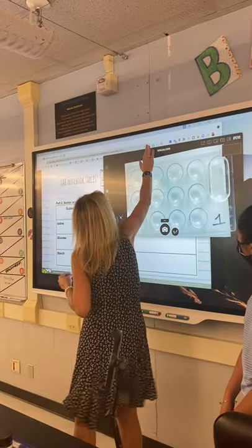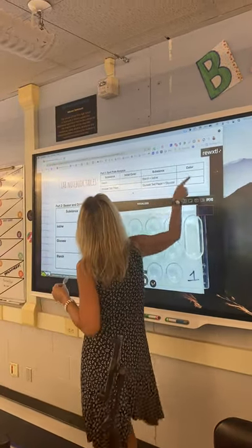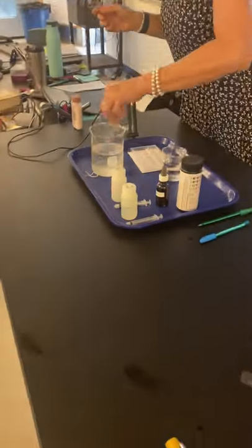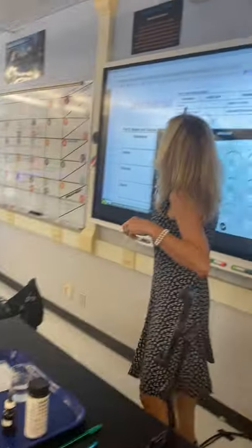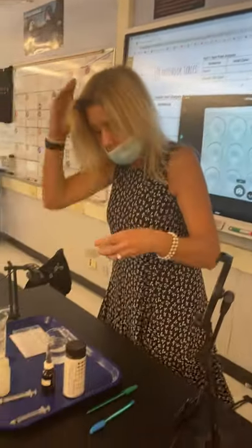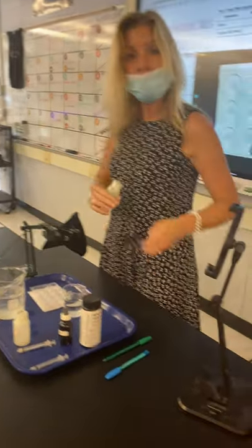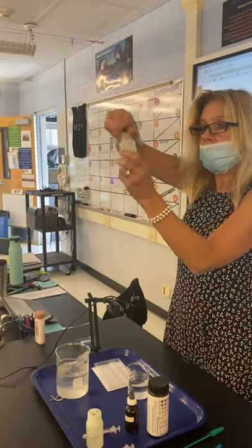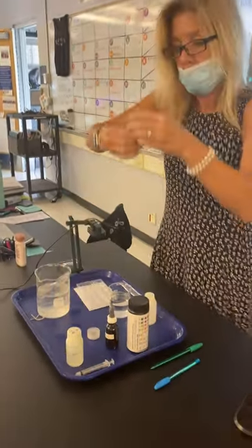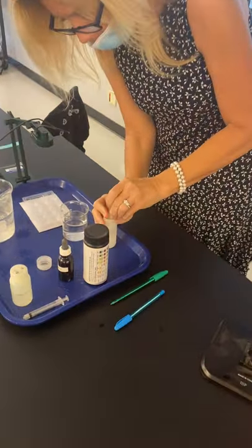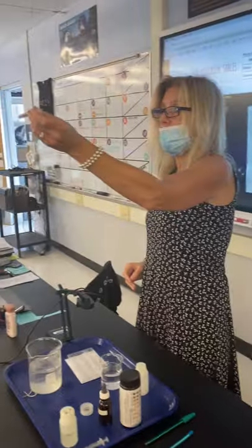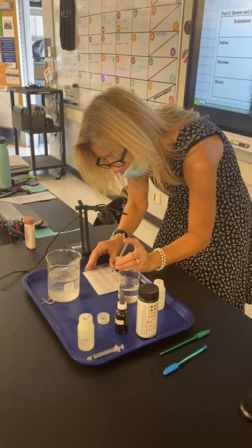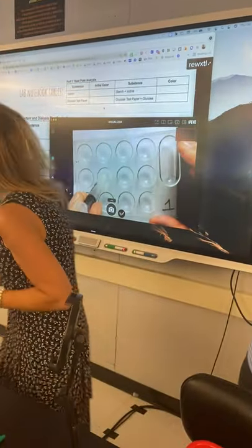So I'm talking about this part right here — this is what we're going to fill in and I'm going to show you here on the spot plate. The first one is starch and what is starch's initial color? So this is glucose and this is starch right here. I'm just going to use this syringe labeled starch. Can you see the starch in the syringe? What color would you say this starch is? Clear — kind of clearish white.